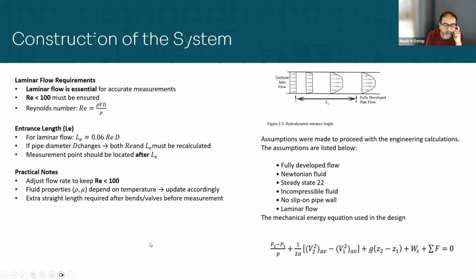Okay. Well, here first, I also want to mention some other engineering design issues that you need to be careful about while transforming an MRI system to a flow MRI system. And by the way, all this engineering design of the previous flow system, we made all the calculations by using these fluid dynamics principles.